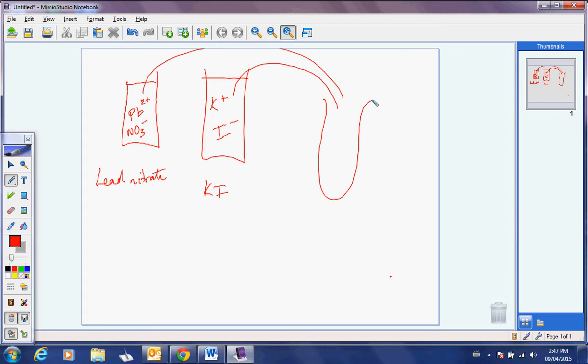Colorless. Okay? Can't say clear. Clear is the opposite. Oh, it is clear, but you could have blue clear things or orange clear things. It just means it's not cloudy. So it is clear, but it's also colorless. And the lead nitrate, describe it. Looks the same. Clear, colorless liquid.